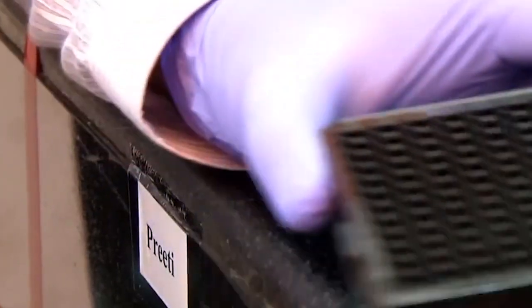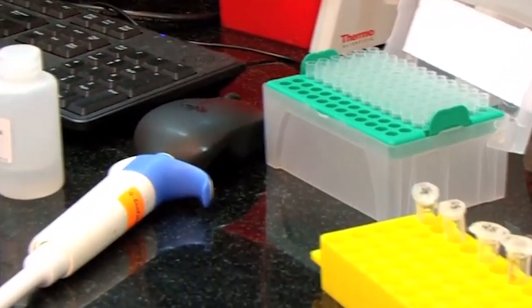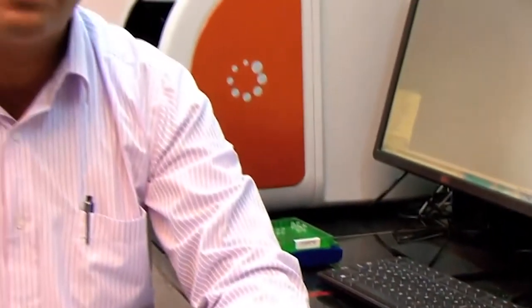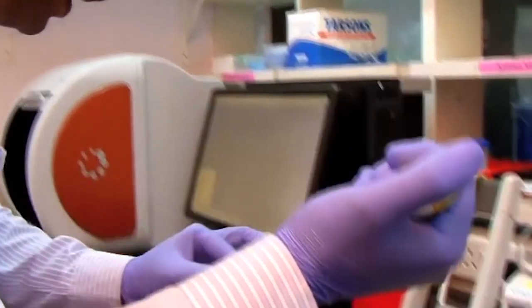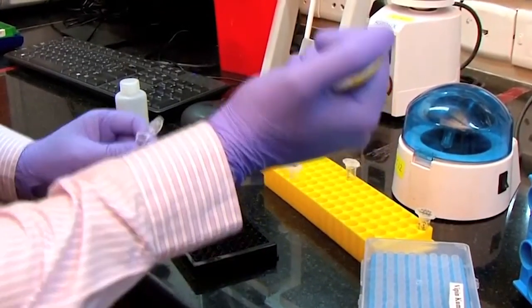Now I am going to add the unknown samples. We have 3 unknown samples here, which I am going to put in B3, B4 and B5. From these 3 unknown samples, we are going to determine the concentration of the unknown apolipoprotein using the standard. Now I am going to add the 3 unknown samples here. I am going to place sample number 1 at B3.